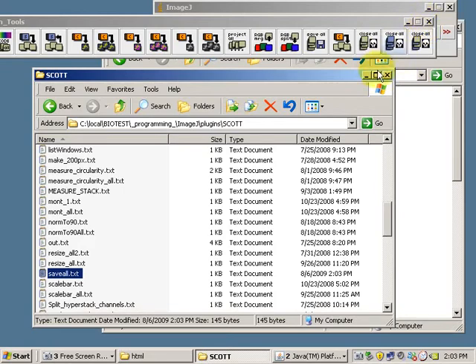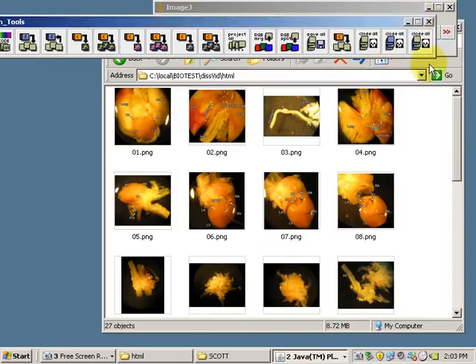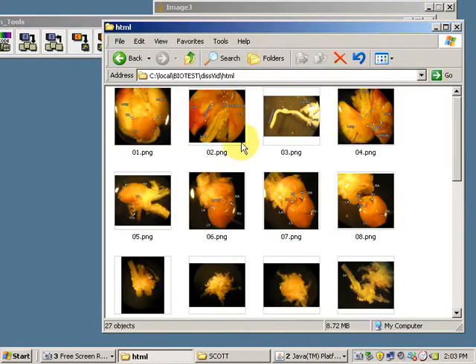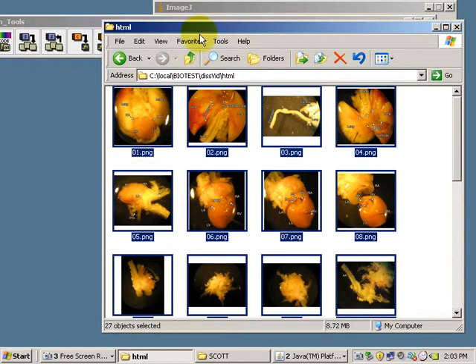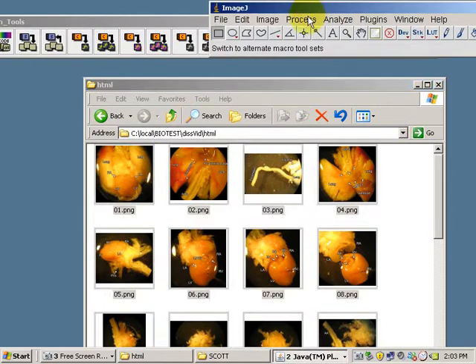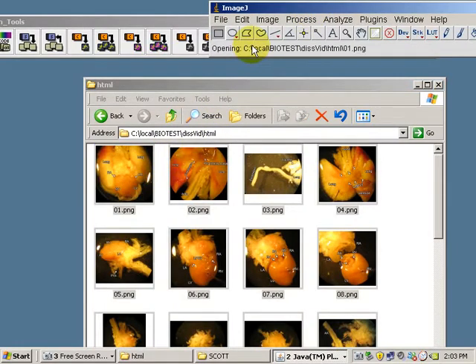And I can select All with Control-A. And I will drag and drop them into ImageJ. And this will open all of the images one by one.